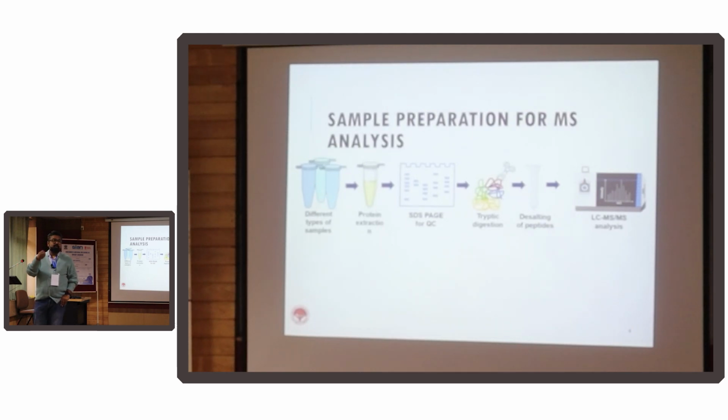When you're using a specific enzyme like trypsin, which is the most used, you're keeping a very specific mark. It will cut only at those junctions where trypsin cuts, right, between lysine and arginine. So that breakpoint becomes your identifying mark, and you know this has been cut by me, not by degradation.